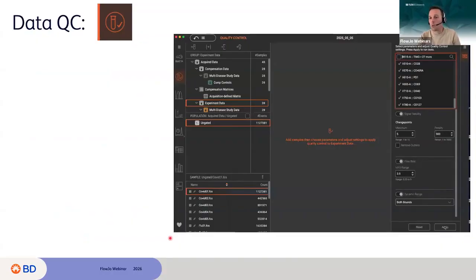If you used QC and FlowAI in particular in FlowJo 10, you know that it was taking about 15 to 20 seconds per sample if you had about 500,000 to 1,000,000 cells per sample. In the QC in version 11, we really improved the performance by a lot.